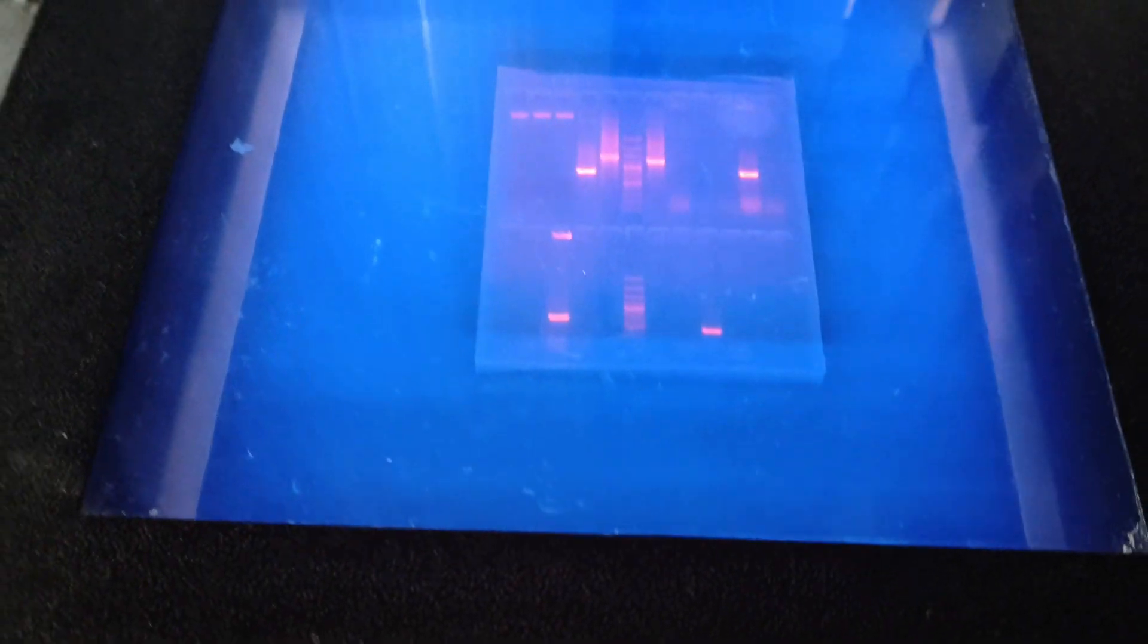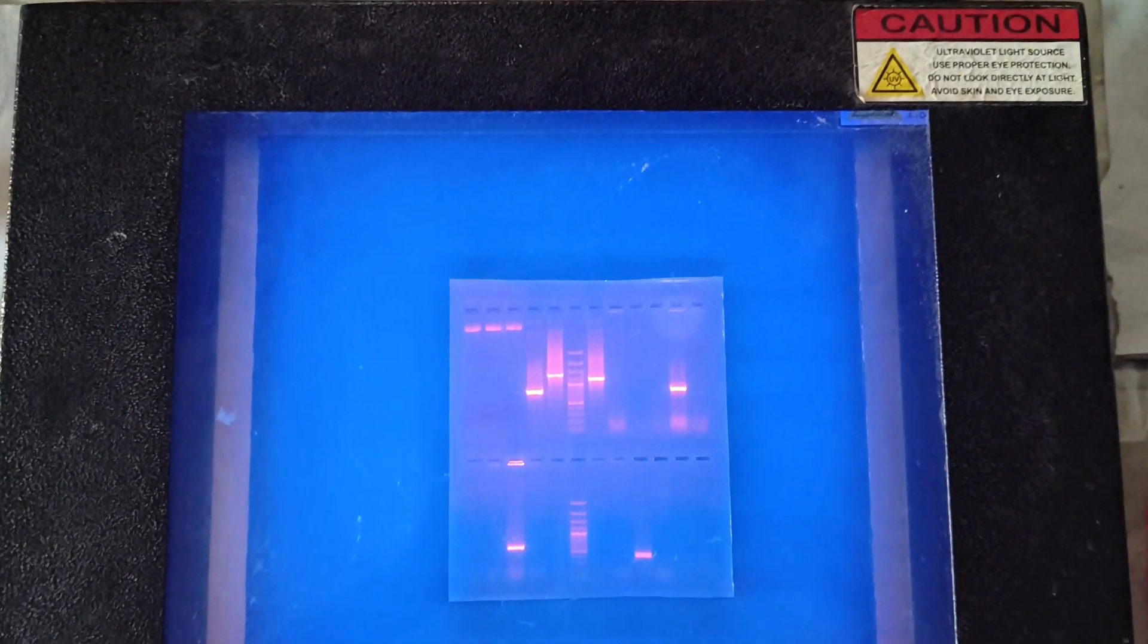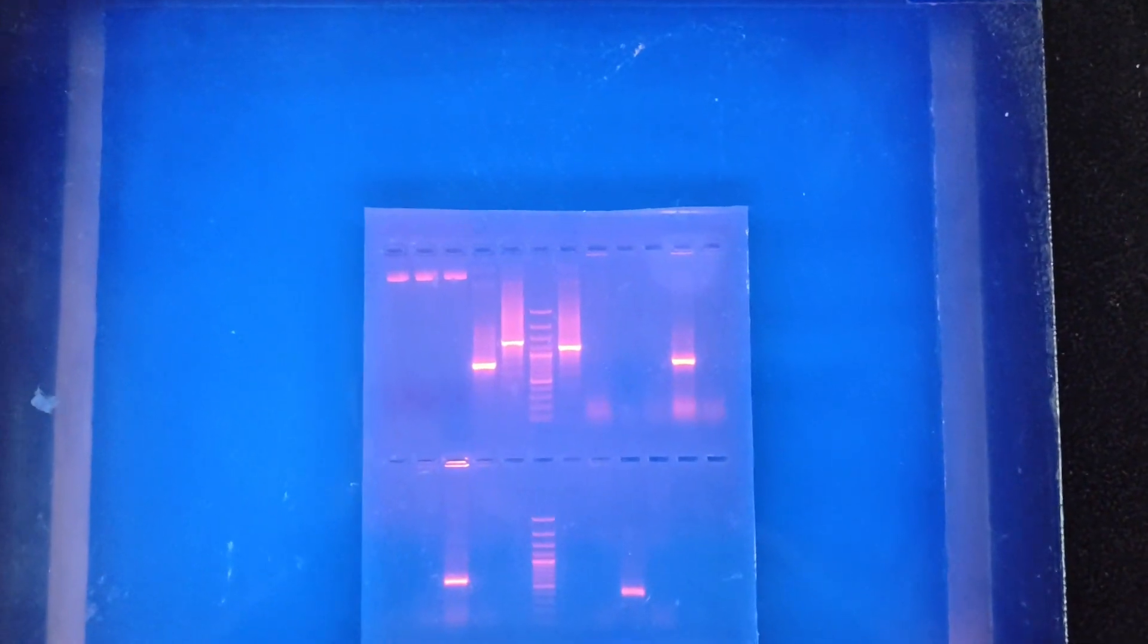Here we can see the beautiful gel under the UV light and the DNA fragments appear as the fluorescent orange color bands.